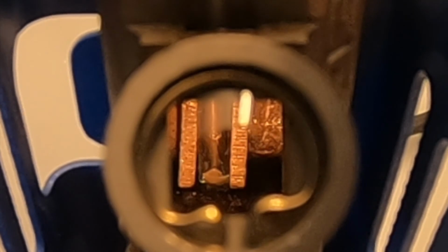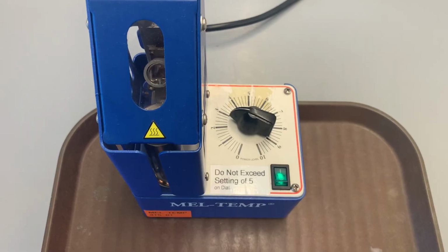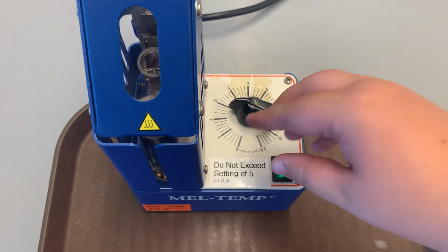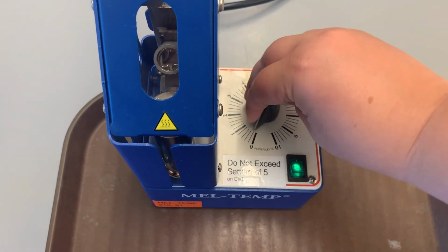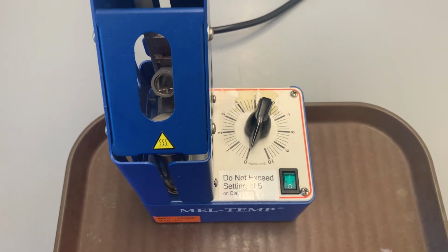If these appear to be the same as the expected value, your substance is either extremely pure or you raised the temperature too quickly. When finished, turn off the Mel Temp, set the voltage control to 0 for the next person, and remove your tube to throw away.